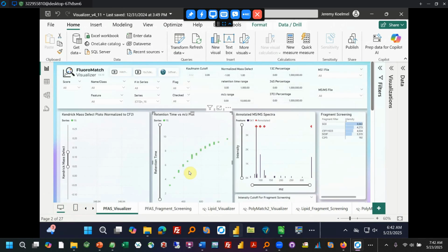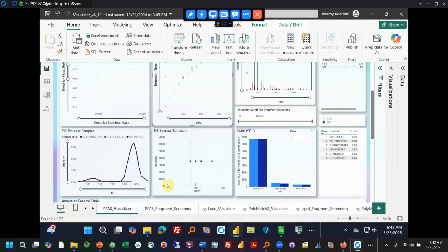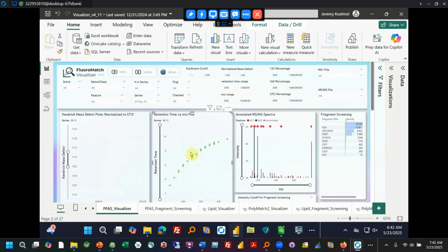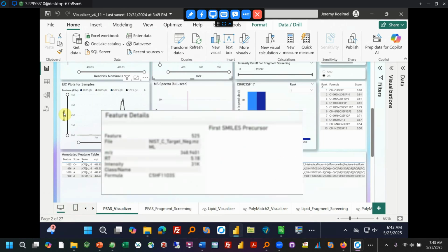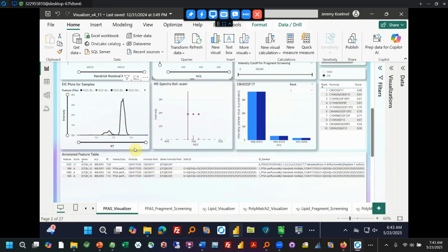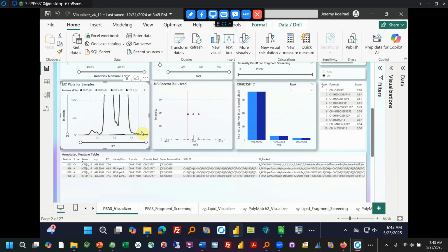And so then we want to just click really quickly through to make sure that there are isomers for all these. There's again 2 peaks. This one has 4, so that's the question, is there actually 4 peaks? And I see 1, 2. It also says that there's one at 7.43, so let's zoom down and see if there is a peak. So probably just tailing. There is one at 7.15, but the 7.43 is probably incorrect, probably just a tail of this species, as you can see.